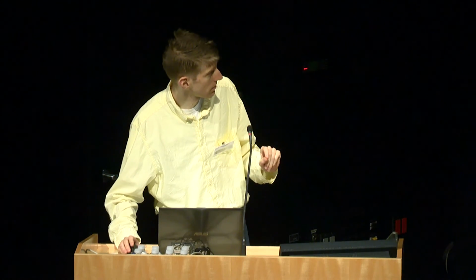Great. So the first question is about expression artifacts and capacitive loading of the cells. Capacitive loading, yeah. So we've measured the capacitance of cells expressing and not expressing, and the capacitive load is very, very small here. And let me just expand on that a little bit.